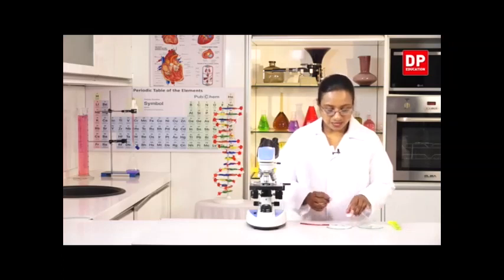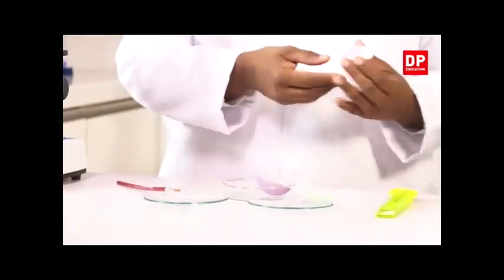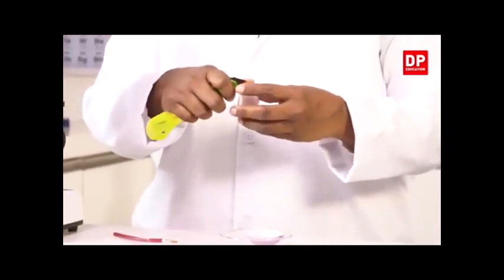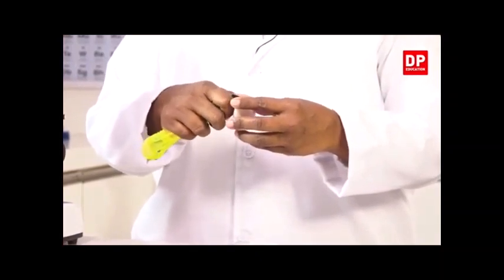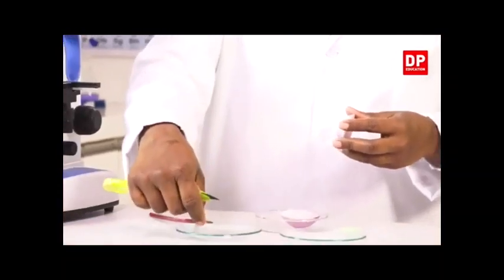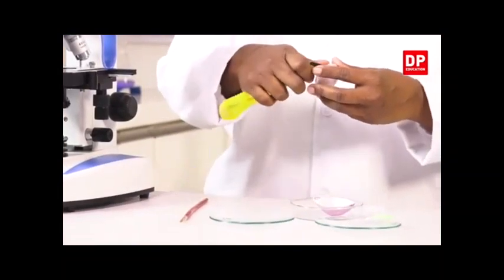First I will take out a piece of onion, and from that I will cut out a few tiny peels. Here we can peel out very thin peels and put them into water.